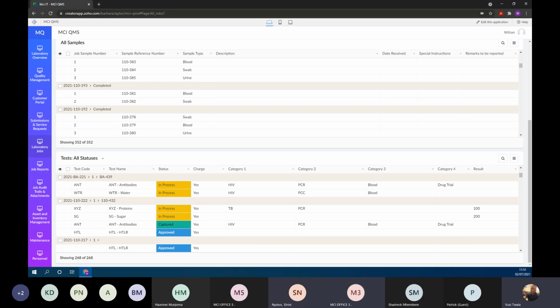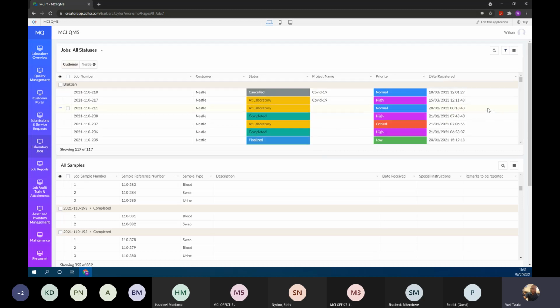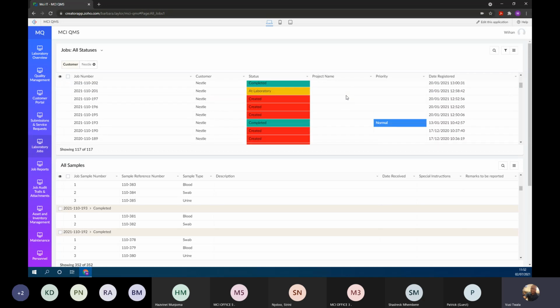Yeah. Just to emphasize the point, Jan. Basically, let's say you are the lab manager. As a lab manager, you want to have a dashboard that shows you all the different teams and their work, because you are overall managing it. Depending on the access or the level of authority you have within the organization, you will see what is relevant to you. If you're a company manager who runs this particular laboratory, you want to see maybe the summary, the dashboard of where things are.